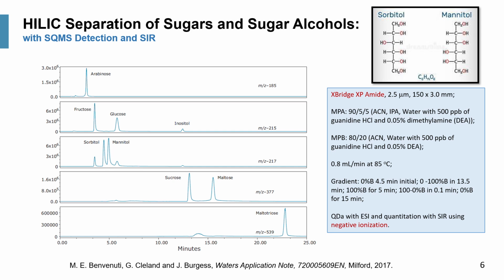Here's an example of a modernized version of sugar analysis using a single quad mass spec and detection using single ion monitoring, showing that this application is from Waters Corporation. So the separation is done using HILIC or hydrophilic interaction chromatography.